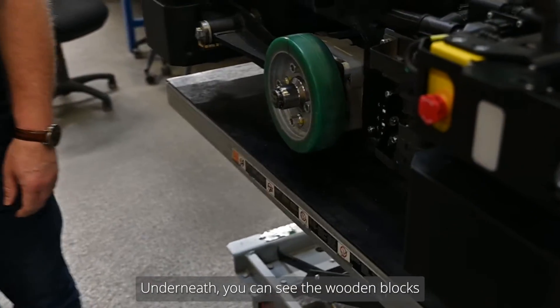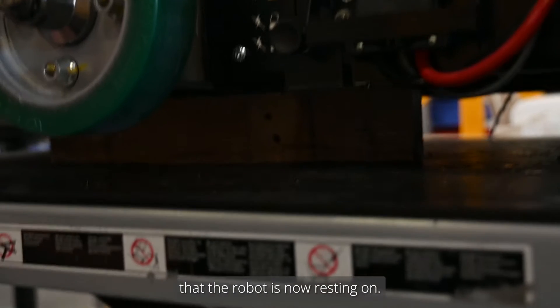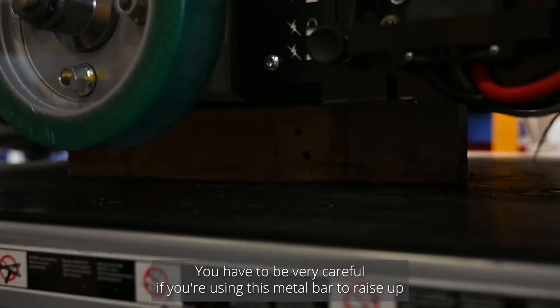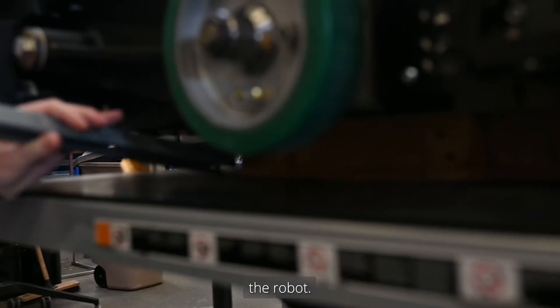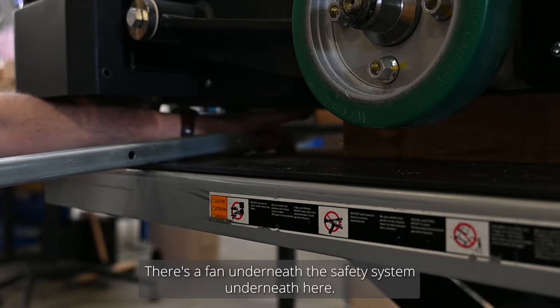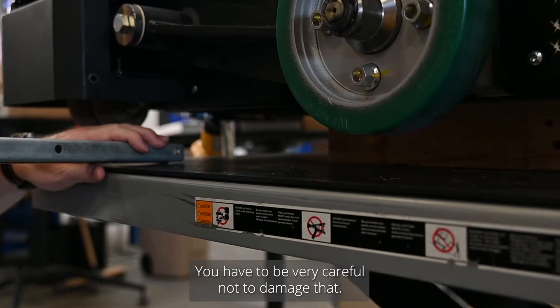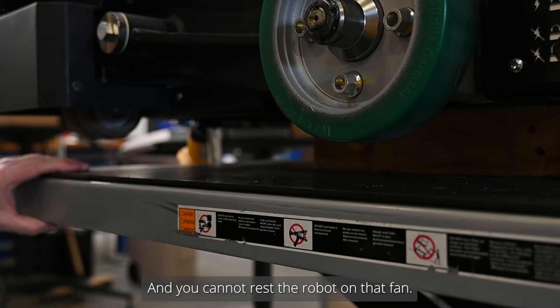Underneath you can see the actual wooden blocks that the robot is now resting on. You have to be very careful if you're using this metal bar to brace up the robot. There's a fan underneath the safety system underneath here, and you cannot rest this robot on that fan.